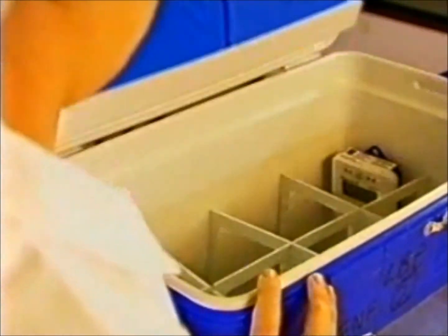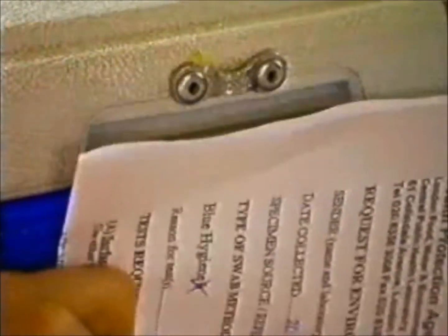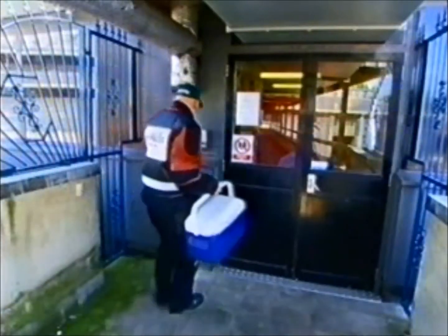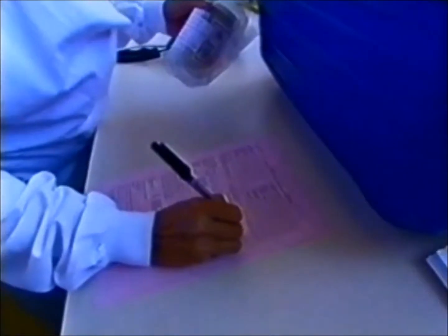The sample should then be put in a cool box with a thermocouple or temperature monitoring device so that we can ensure it is maintained at the appropriate temperature. It should be transported to the laboratory as soon as possible — especially if it is an outbreak-related or formal sample — so that we minimise the chain and have as few handovers as possible. There should be appropriate documentation so that whoever has taken the sample signs it over to the next link in the chain, and we sign the documentation on receipt at the laboratory.